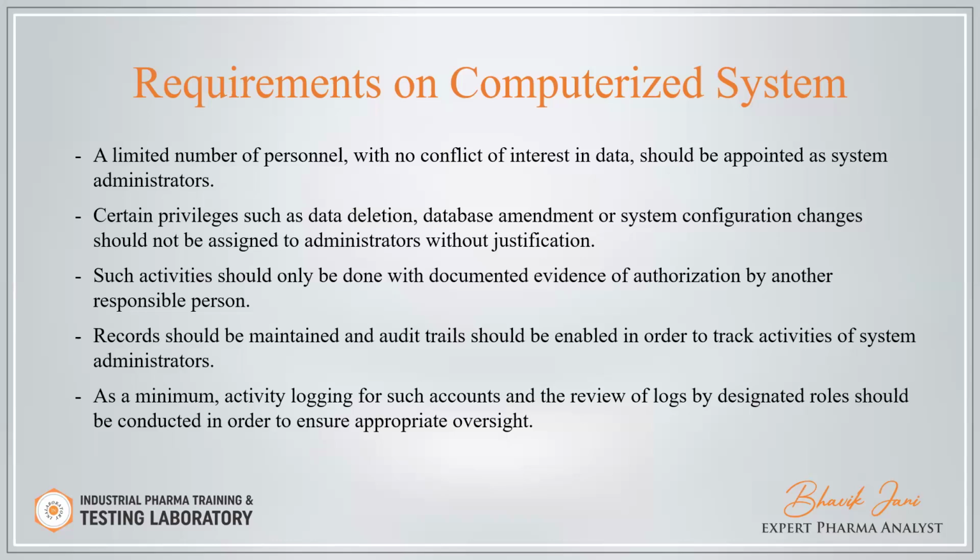If it is not possible to remove these critical privileges from the administrator user, then in such cases any changes to data should be authorized by the responsible person through change control or any QMS system.